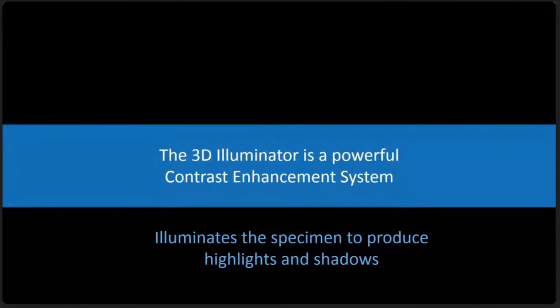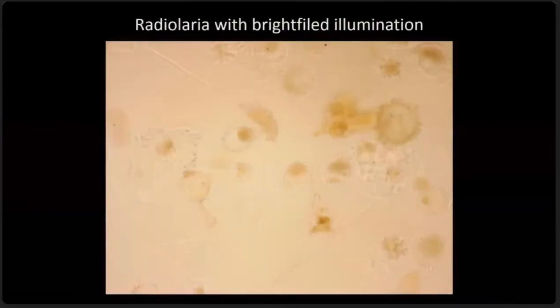So let's look at this. The first thing it is, it's a powerful contrast enhancement system. And this is really important because it produces highlights and shadows on specimens that allows you to get better visibility, allows you to see it where otherwise you couldn't really see very much.